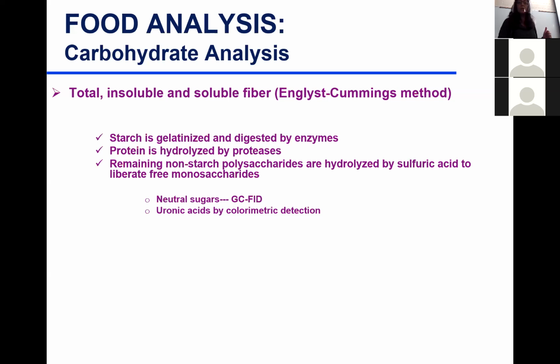The free monosaccharides at this point are then derivatized by acetylation to form stable, thermally stable and volatile compounds that you can measure with GC-FID.